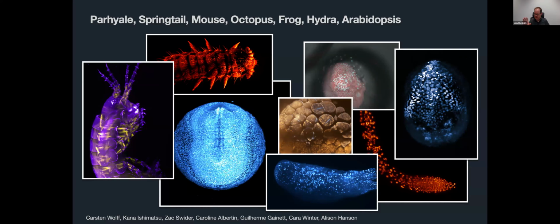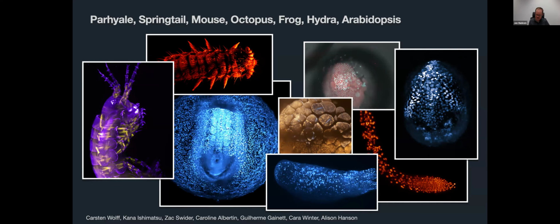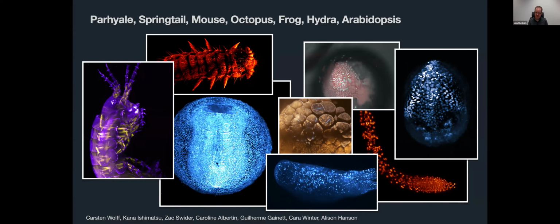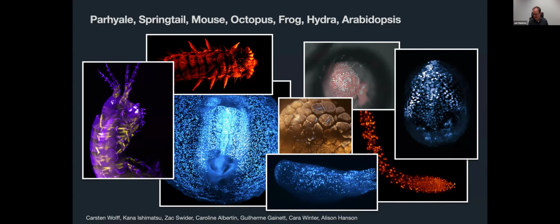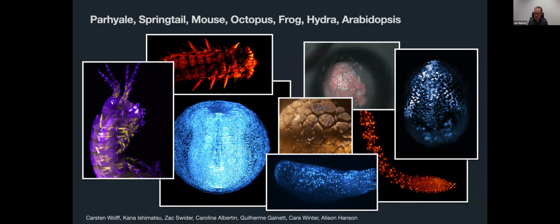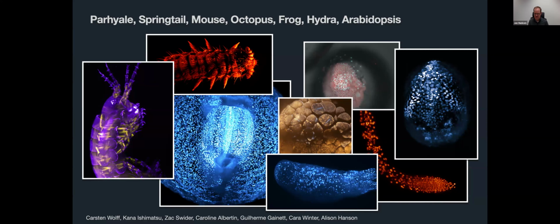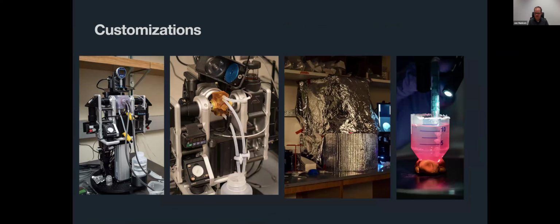Right? So we've imaged a lot of different samples, and this really suddenly allows us to also get out of our comfort zone and not just image some zebrafish, but really go out there and image some organisms that maybe haven't really been imaged successfully, because people haven't really had the chance to get their hands on a high-end system in those locations where those samples exist, right? And so suddenly we find ourselves traveling with these microscopes to places that typically don't have access to high-end microscopy.